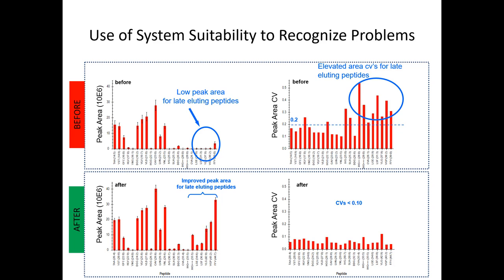So what they did is they checked the flow calibration, and they found out that the A pump was working fine, but for the B pump, someone had entered in the wrong volume for the amount of time the pump had been pumping to do the measurement, and so it was pumping too slow, which means these peptides were not fully being eluted from the column reproducibly and appropriately.